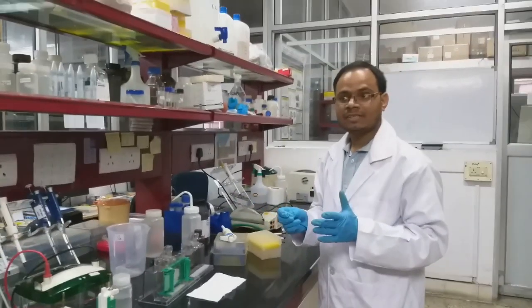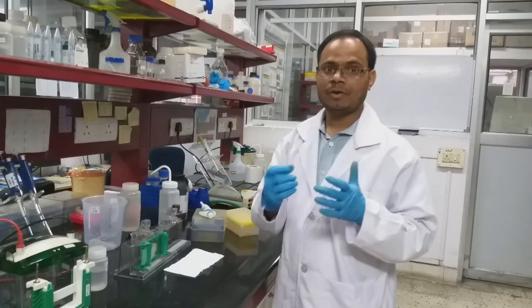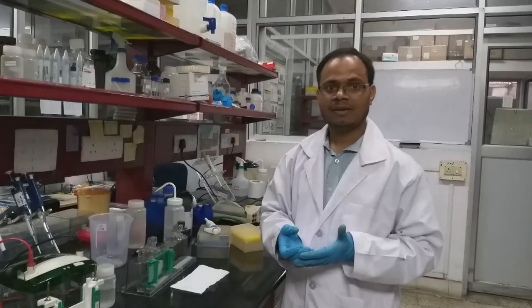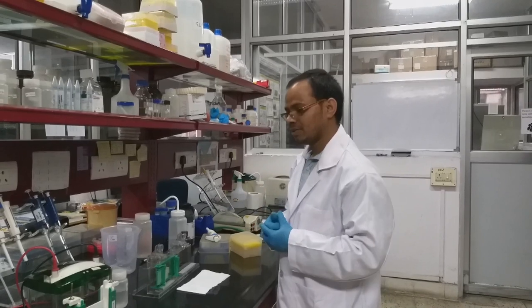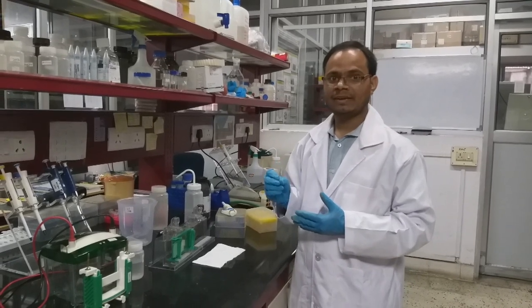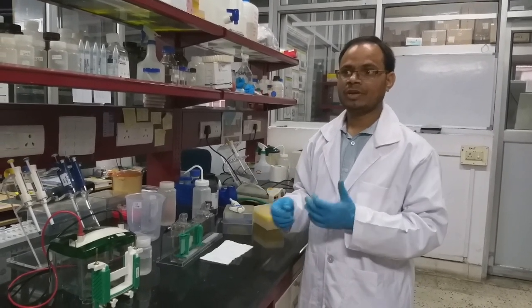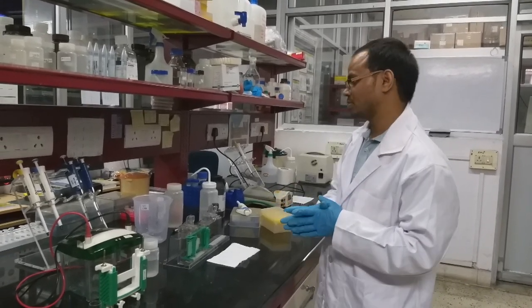After this, we have to overlay the top layer with some solvent like 2-butanol or isopropanol, or with water. Why are we doing this? Because if the gel is exposed to air, then the oxygen from the air will interfere with the polymerization of the gel. So we have to add either water or 2-butanol for this purpose.